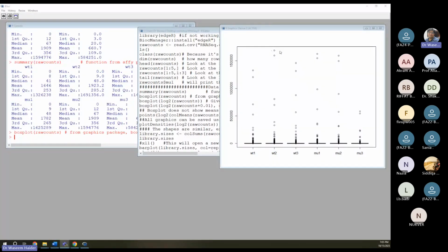So that number is quite big. There was one data point that was getting counts as 1.7 million. Somebody was getting 1.6 million. Somebody was getting 1.5 million. So we have the millions here, and we have the numbers like 1, 2, 3, 4, 5, 6, right?